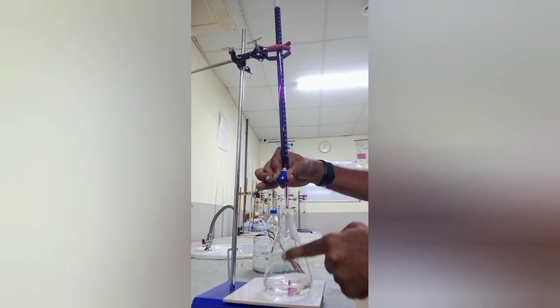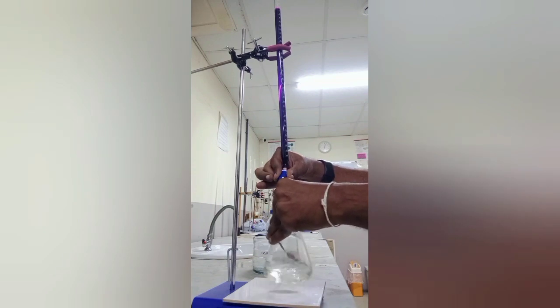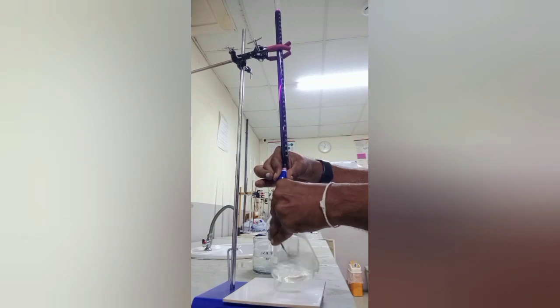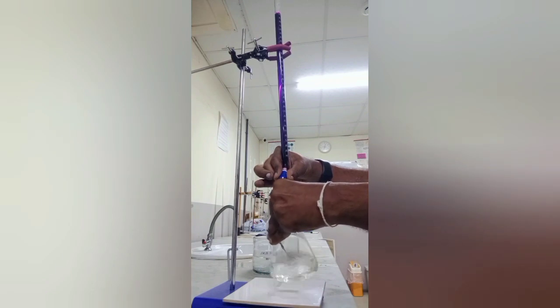It will bring wrong calculations, because the drop is not counted, and that leads to a wrong calculation. No need to see the burette reading. Your eyes should focus on the endpoint only.